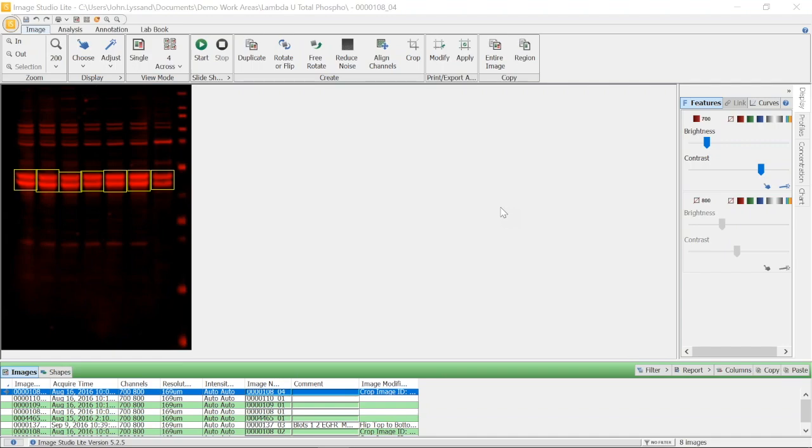Lanes 1 through 3 represent samples from non-induced cell lines, and lanes 4 through 6 represent samples from cells induced with EGF. The seventh lane is 10 micrograms from a Jurkat negative-control cell line, and the last lane is a molecular weight standard.